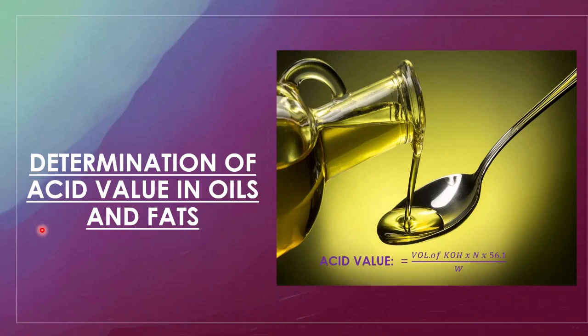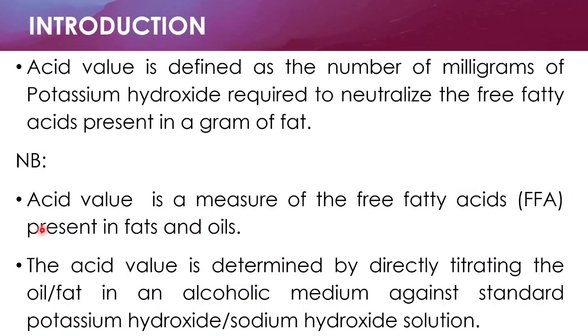Today, we are looking at the determination of acid value in oils and fats, or in short, in lipids. We'll start our introduction by looking at what acid value is.